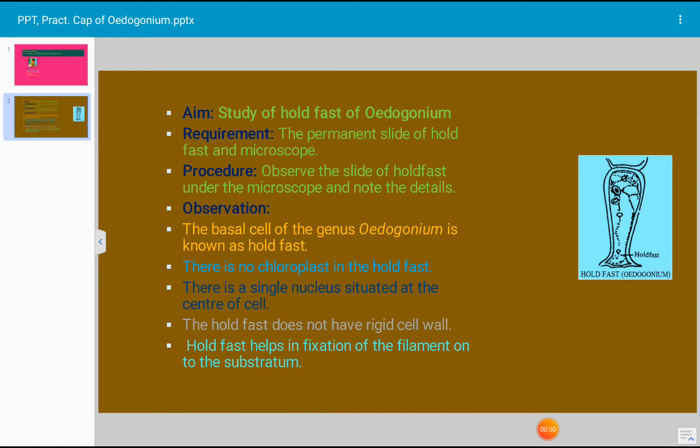In procedure, what we have to do is observe the permanent slide of hold fast under the microscope and note all the details of hold fast of Oedogonium. Oedogonium is an algal plant.